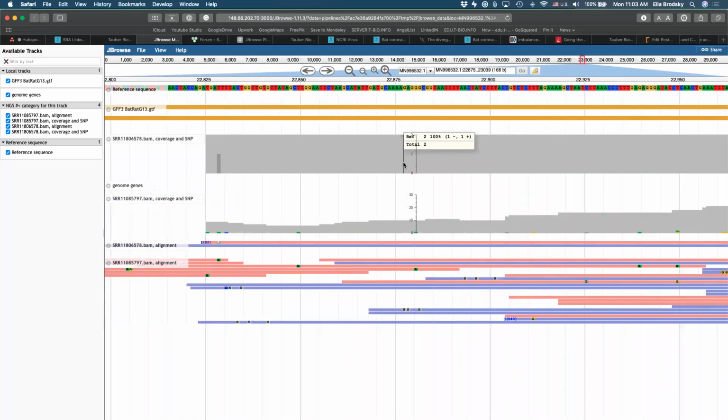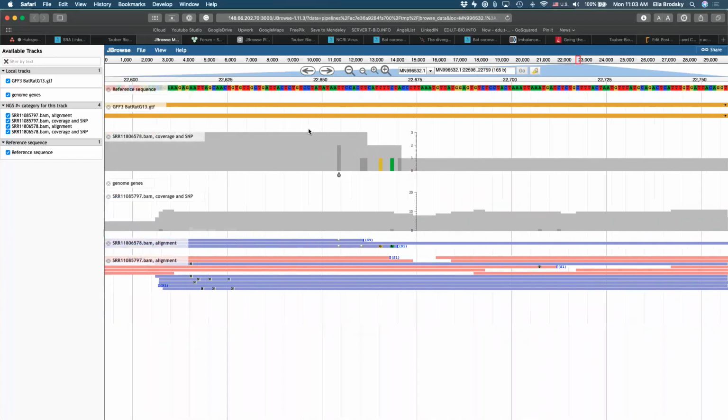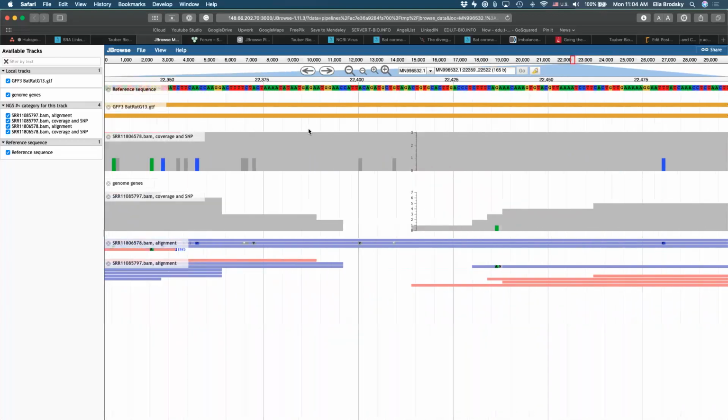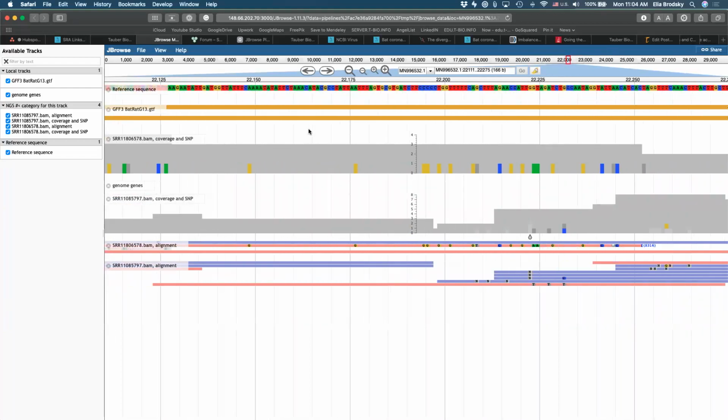Does anything else pop out? Okay, SNPs. Excellent, thank you.